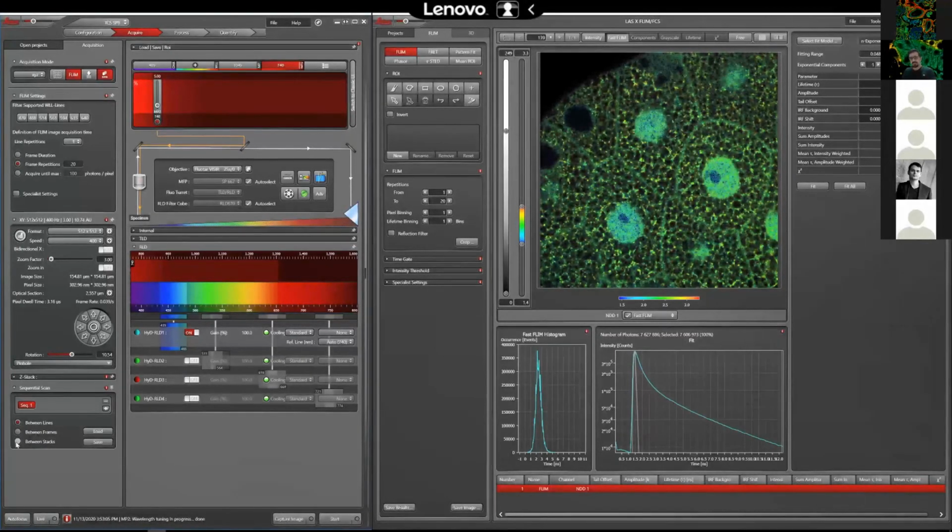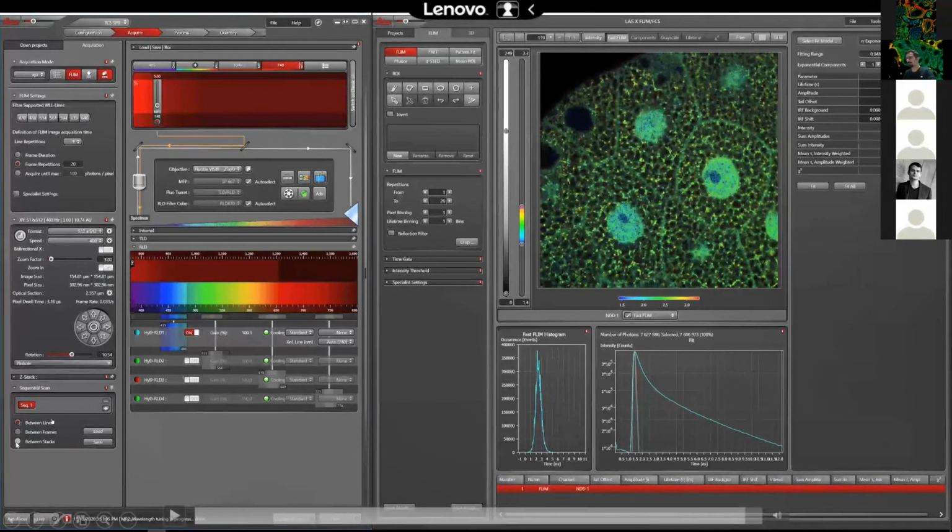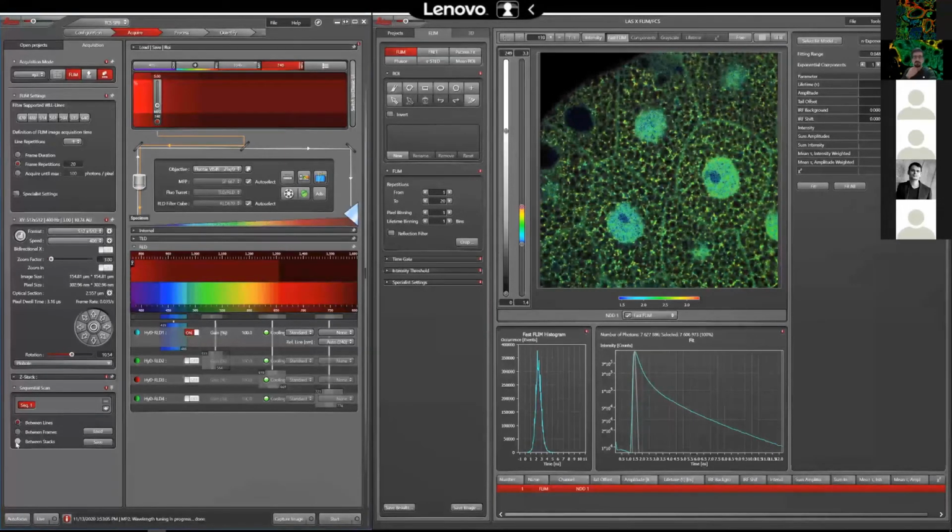But since then we have to switch between wavelengths using a tunable laser that takes something like 16 to 20 seconds to tune from one to the other, so we need to switch the sequences for the NADH and FAD between frames or between the stacks. So we cannot switch between lines, we cannot be fast, we cannot be virtually simultaneous in this imaging. But with the data that we have acquired, we realize that we don't have much misplacement of the sample in the field of view when we are doing the measurement.